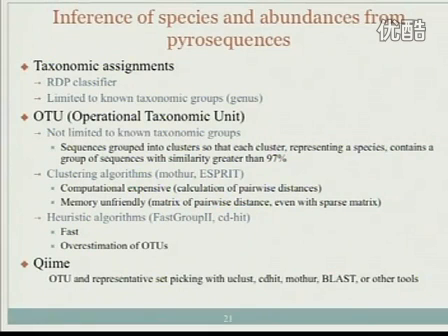Essentially, you just map those reads back to the known 16S RNA genes. You can do alignment or whatever method you can think of. Then you have to have a database of all of those. There are several databases out there. One is Greengenes. So you can just search your data set of 16S gene fragments against Greengenes.